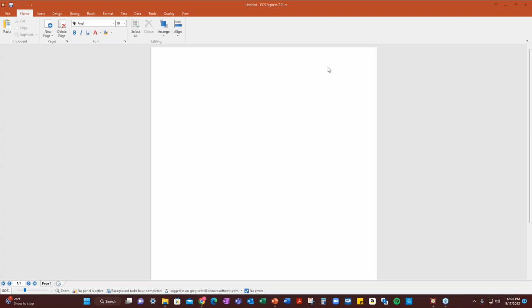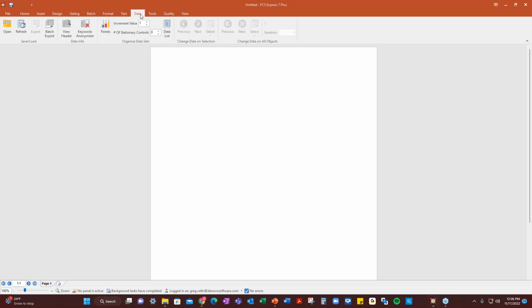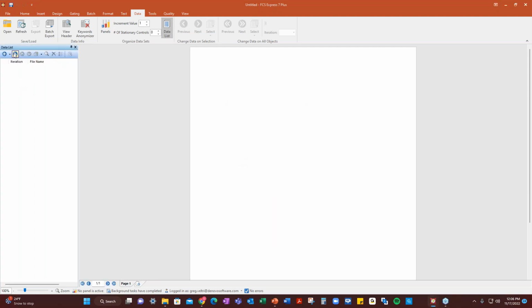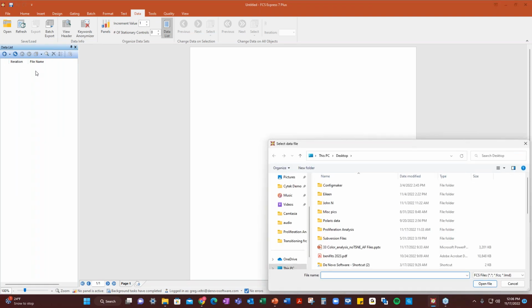Okay, and on this blank template, the first thing we want to do is bring in some data. So let's go to our data tab and data list, and I'm just going to take this and anchor it over here. And I'm going to go and get some data here.